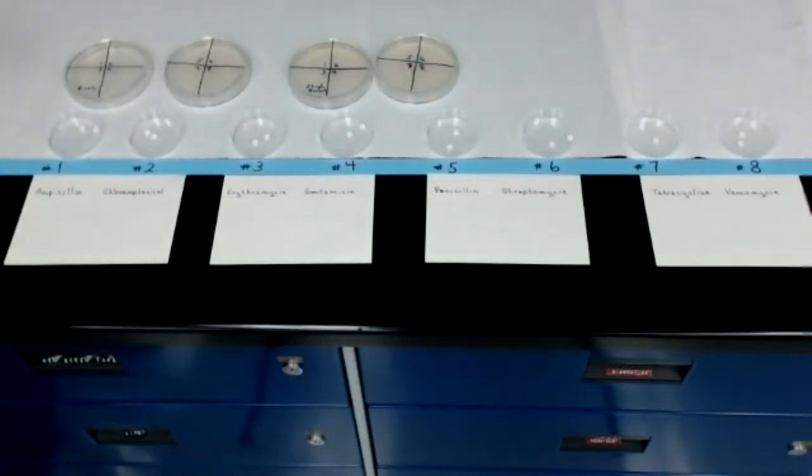On camera, you'll see that there are 8 small dishes, each of these dishes having 2 small absorbent paper discs. The antibiotics that are in these dishes are numbered 1 through 8, and they match the order as found in Lab Module 16.